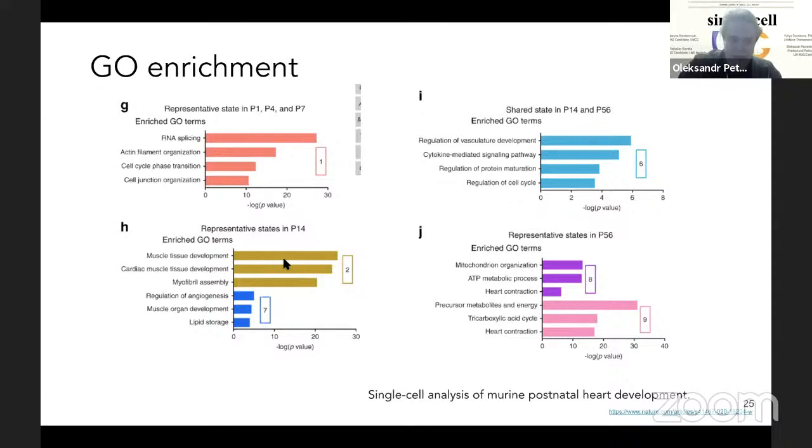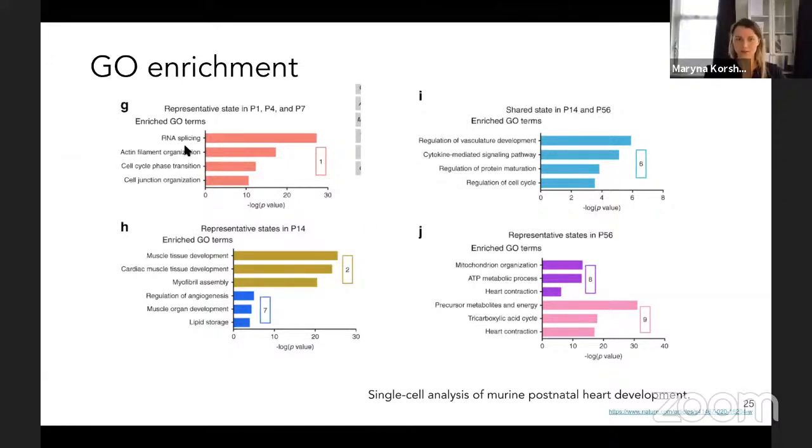And then when you have something interesting, for example, cytokine-mediated signaling in your microglial cells in the brain, then you can go deeper and actually see which genes are overexpressed. Because if you just send them a big CSV file with, I don't know, 500 genes, it can be a little bit scary, and this is much more human readable. Yeah, and as well as plotting different genes, you can also plot these gene enrichment terms.